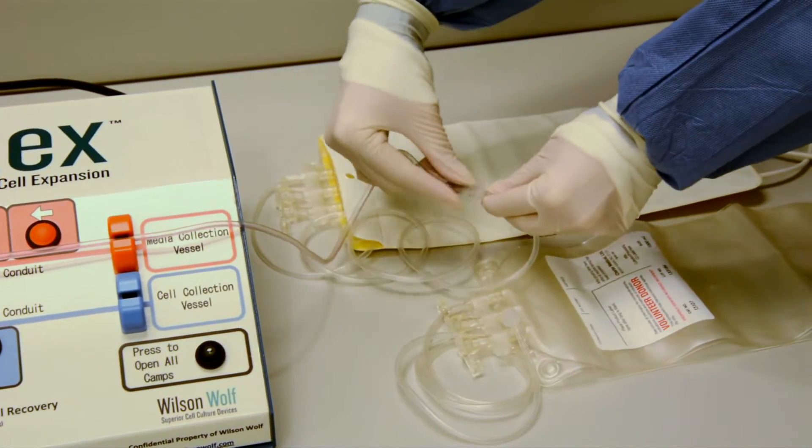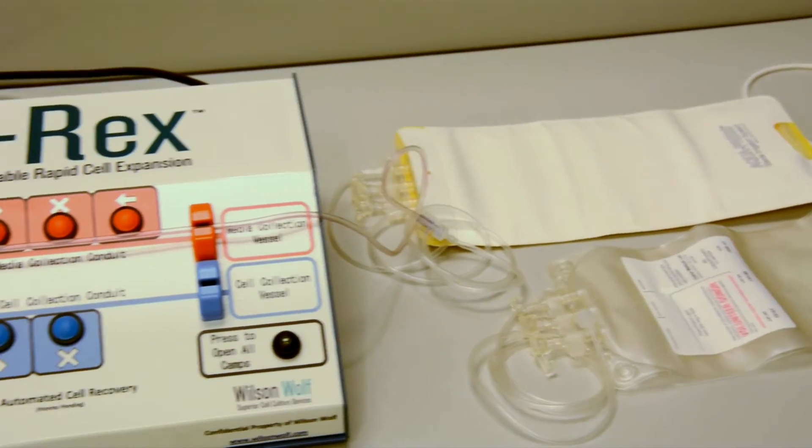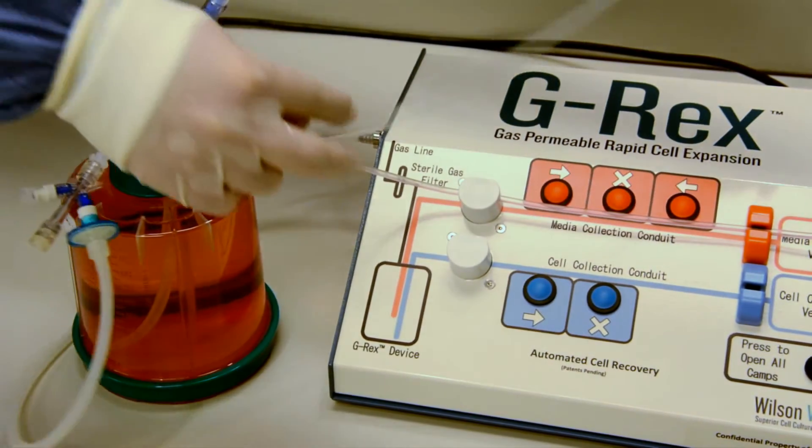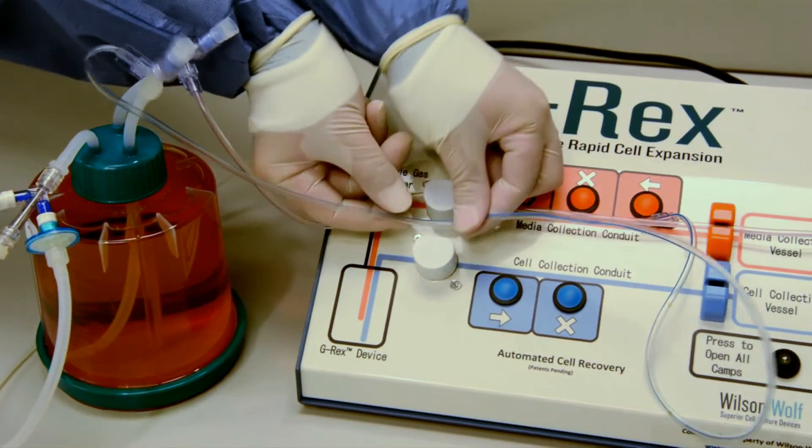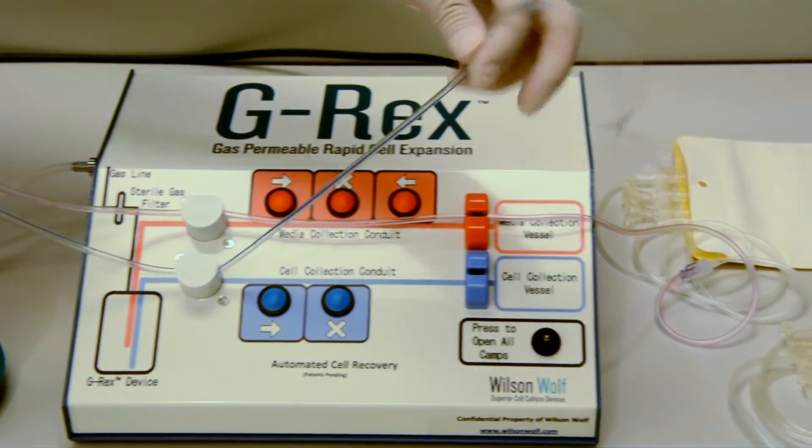The media line is connected to a sterile media collection bag. Here, the bag is placed inside an aqua press pouch, which we will later use to rinse the G-REX after the cell harvesting stage. The cell collection line is set up similarly and connected to a sterile cell collection bag.